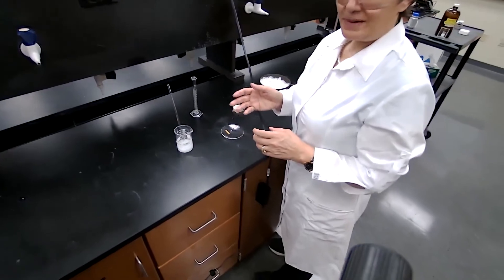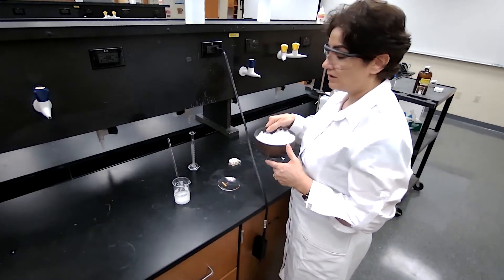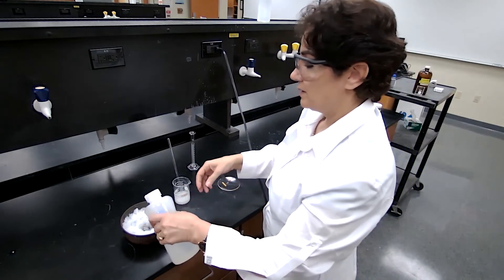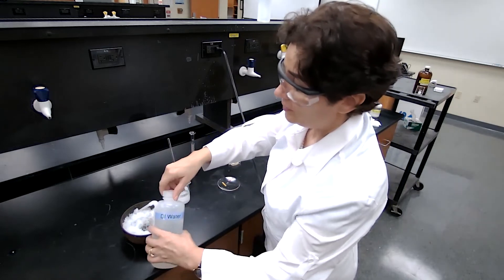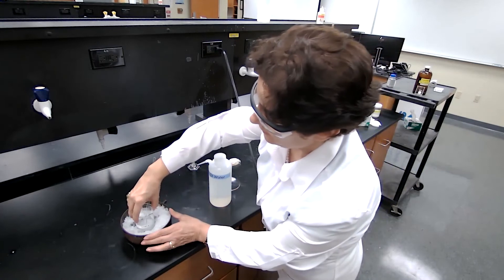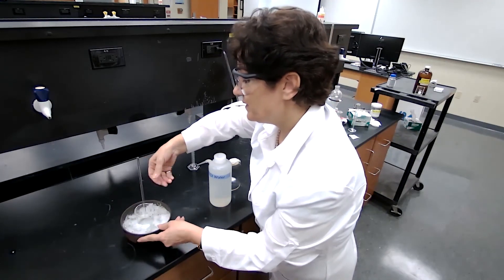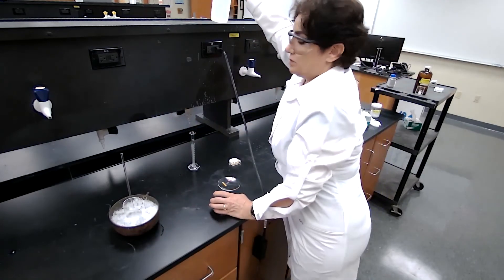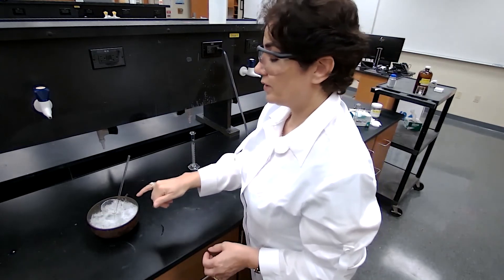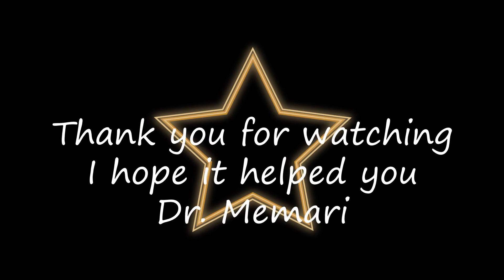Solubility is directly proportional to temperature, as discussed in the last experiment. For complete crystallization or precipitation, we place our crystals in an ice bath. I have a copper pot with ice and I'll add some deionized water — ice mixed with water is more effective than ice alone because of better contact. We leave it for about five minutes to reach the low temperature of the ice bath, and then we are going to separate the crystals using vacuum filtration.